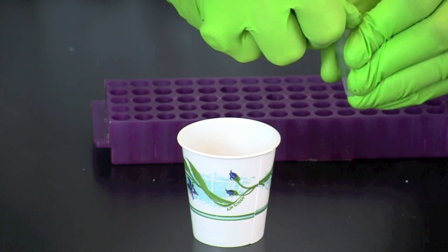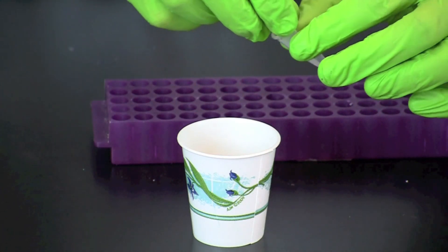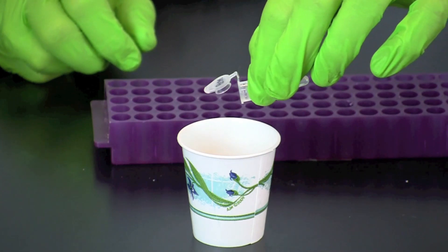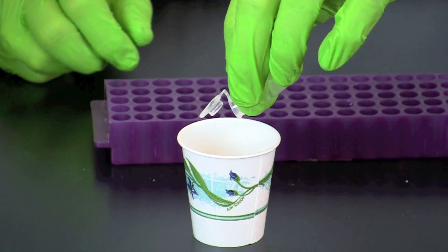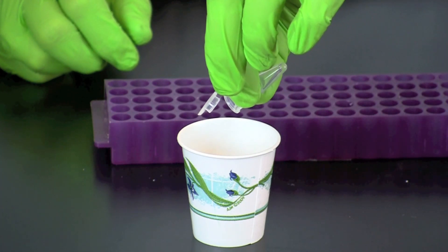After pelleting the cells, pour off the saline solution. Be careful not to lose the pellet. A small amount of saline should remain at the bottom of the tube.